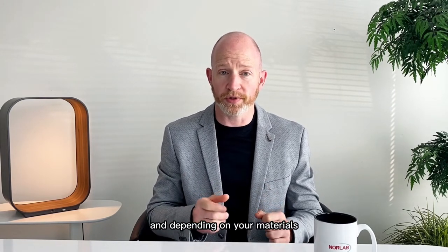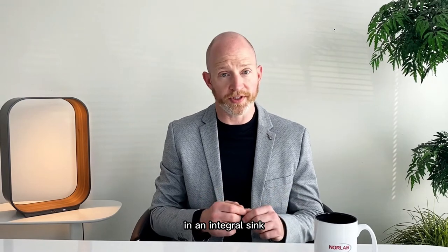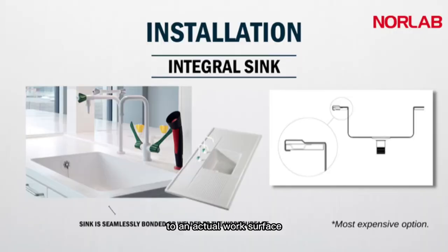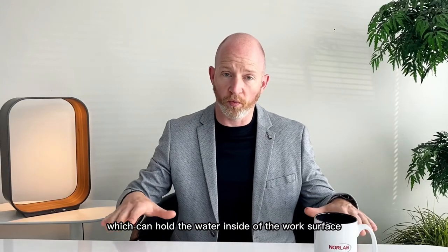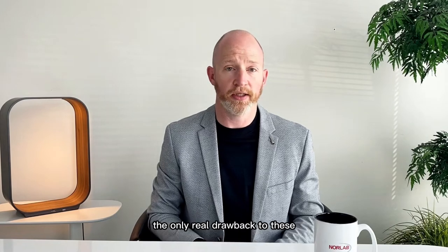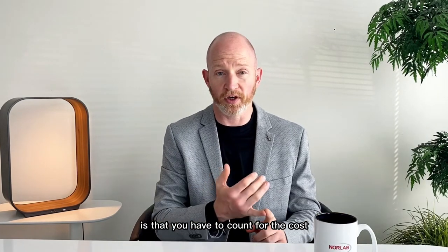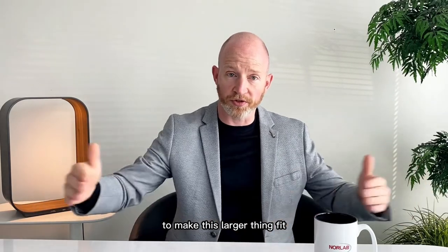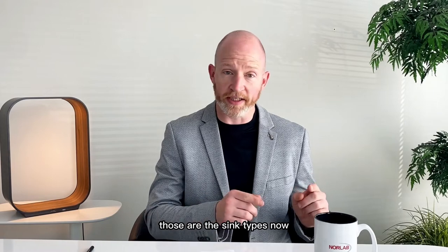Depending on your materials, you might have to reinforce the sink. In an integral sink, the sink is bonded or welded to an actual work surface at the factory, so you get the sink and a length of countertop. The bonus is that there's no seam, so it's perfectly smooth. They usually come with added features like marine edges, which hold water inside the work surface in case you splash, and drain boards. The only real drawback is cost — they're a little expensive — and you need to leave space to make this larger thing fit.